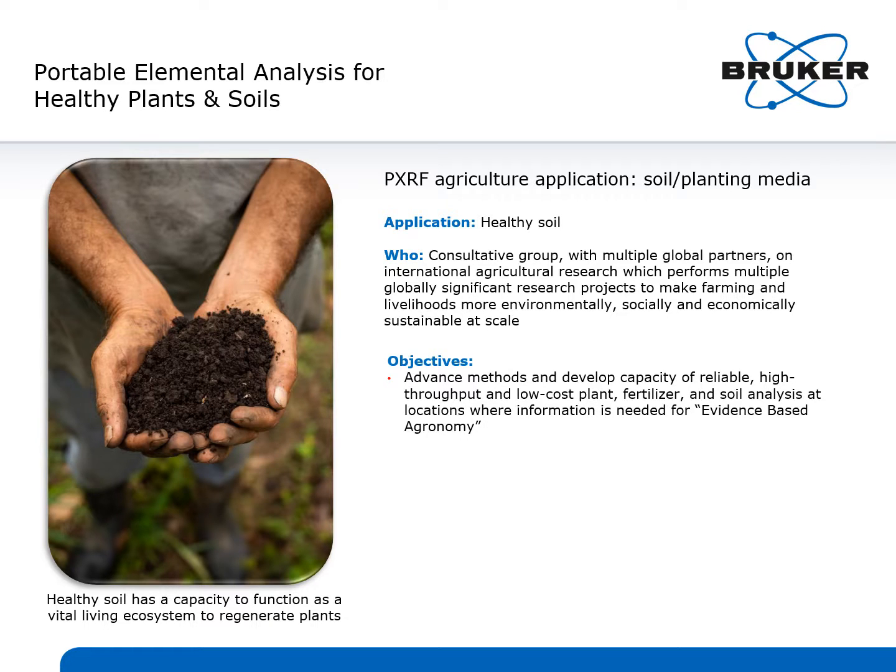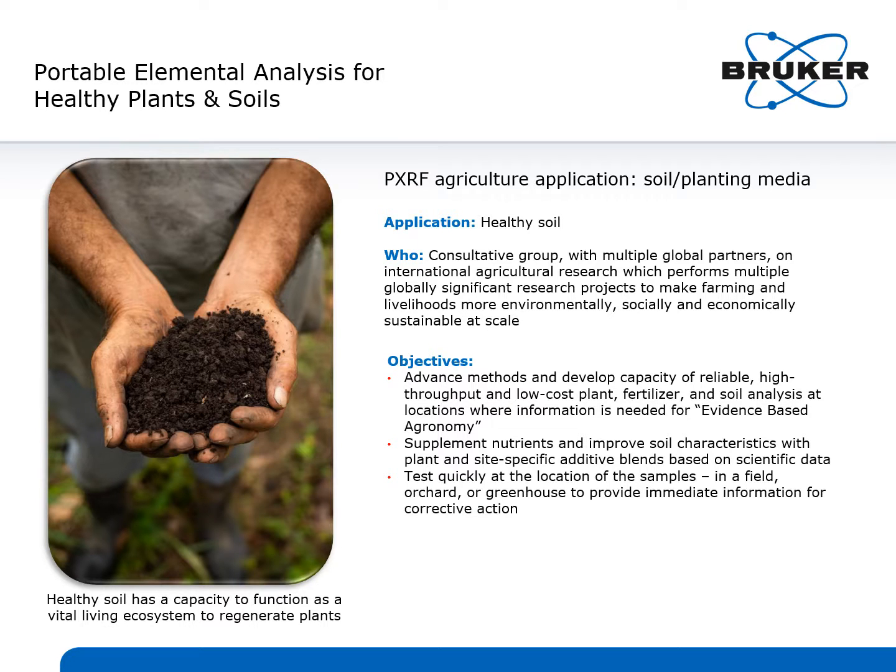They develop and disseminate low-cost portable elemental analysis methods for plants, soils, and fertilizers to enable evidence-based agronomy. They also support farmers with limited resources in challenging climates to ensure they are supplementing native growing conditions with the correct fertilizers and other additives. Their portable methods enable quick testing of the samples wherever and whenever they are needed.